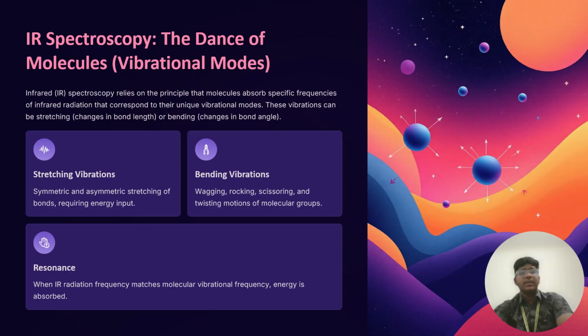IR spectroscopy, the dance of molecular vibrational modes. Infrared spectroscopy relies on the principle that molecules absorb specific frequencies of infrared radiation that correspond to their unique vibrational modes. These vibrations can be stretching, a change in bond length, or bending, a change in bond angle.